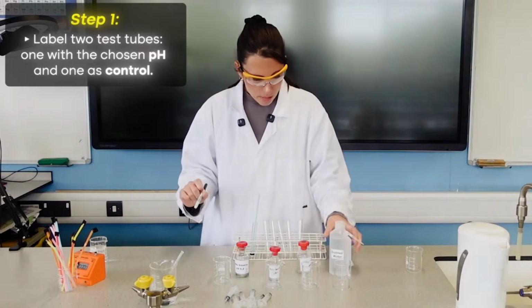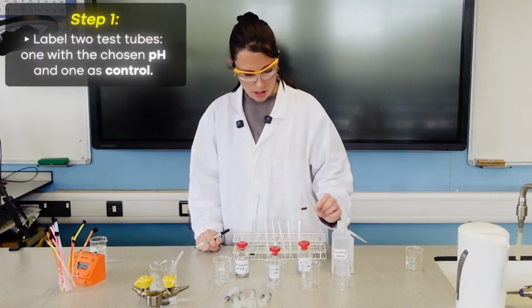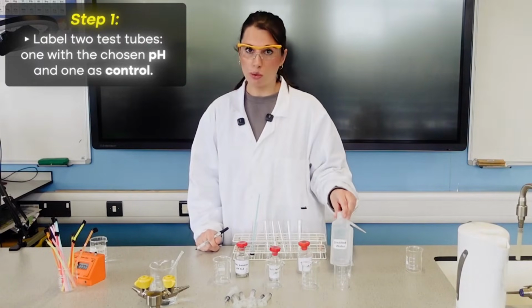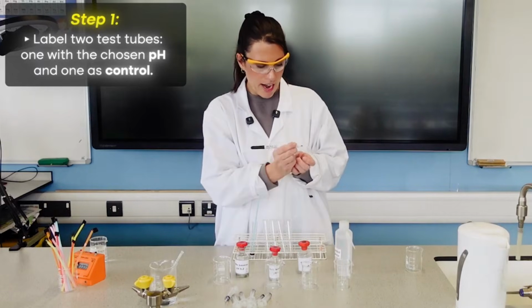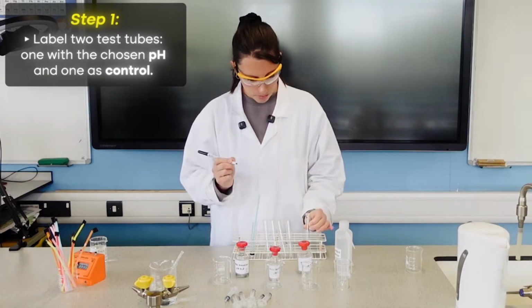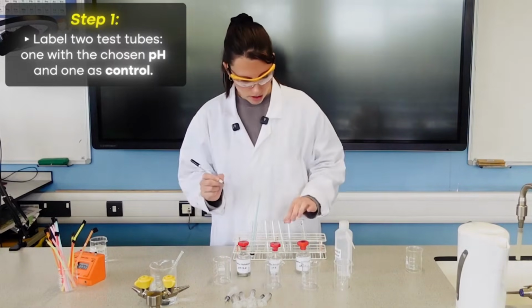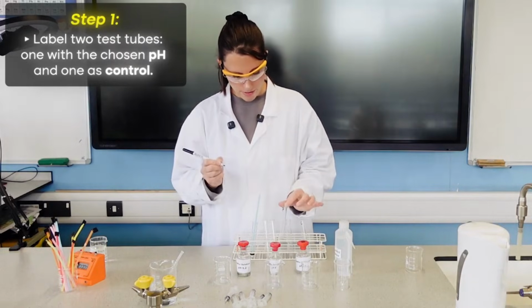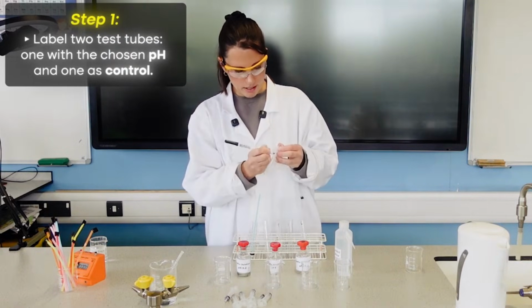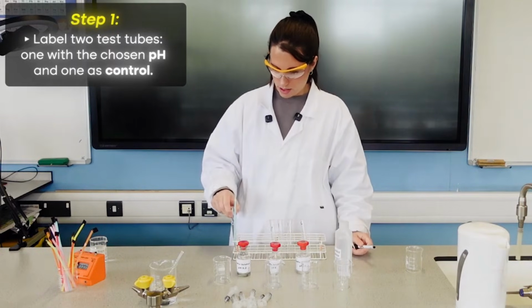Now I'm actually going to label my test tubes before I go any further to make sure I do put the correct thing in each. So for my distilled water, that's what I'm using as my control experiment. So I'm going to label that as C for control. I've now got pH 7, 4, and 9.2. So I'll label as 4, 7, and 9.2. And these over here are just spares.